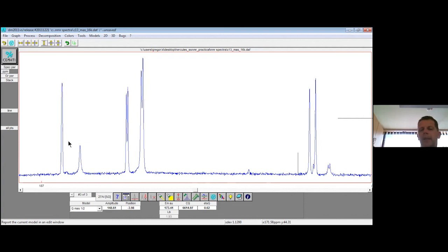Then it is useful if you take a look at the carbon spectrum and see several lines, and you are able to say, okay, this line belongs to a methyl group of a molecule, this line belongs to a carboxyl group of this molecule, this line belongs to this site in the molecule, this line belongs to that site. Some of this you can learn from the areas where you get the signals, so with experience. But there are also ways in which you can get at least preliminary, helpful information.